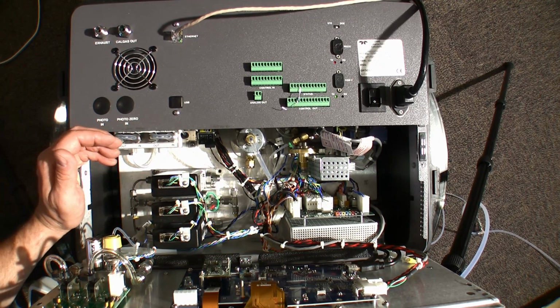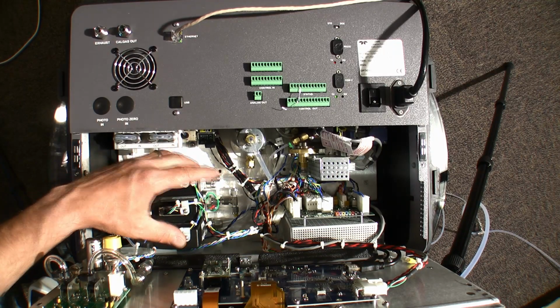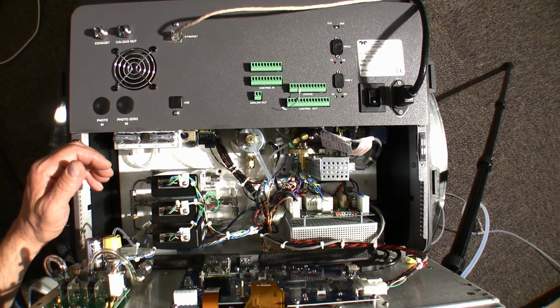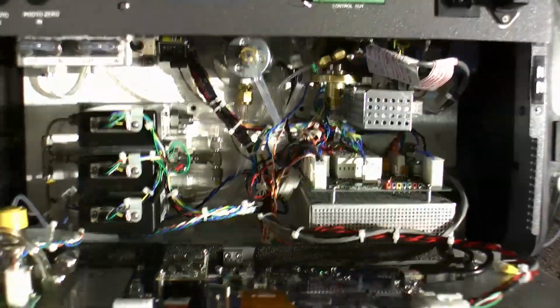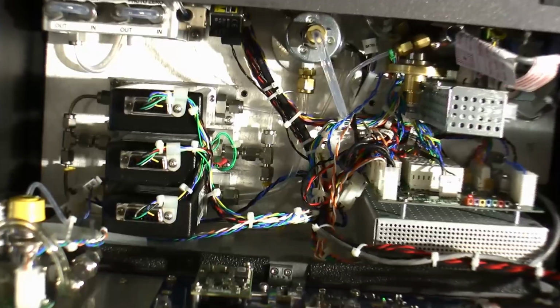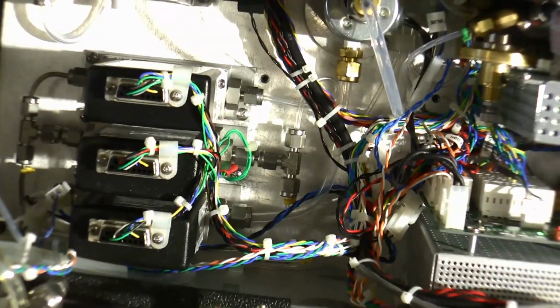When I'm performing a calibration on these mass flow controllers, I prefer to make my measurement right at the output of the flow controllers. Zoom in a little bit here. The reason is that if there was a leak in the instrument, I wouldn't want to calibrate with that leak in there. I would want to calibrate right at the mass flow controllers, and that way I know that at least the calibration of those is as accurate as possible.